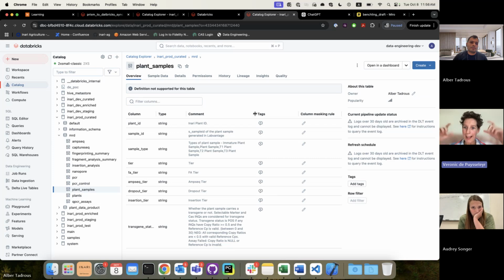So it is plant level information on the genome. It's way safer to combine the qPCR with the plant schema and then just code the logic to look it up. I think their process is they do a qPCR analysis and then they do the AMP-seq. But in science, we do not follow the same process. We sometimes do the AMP-seq and do the TaqMan weeks or months later.